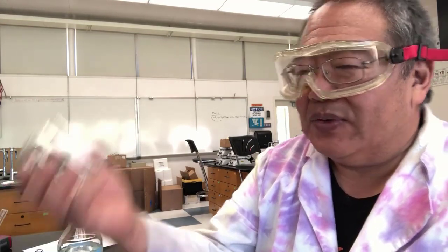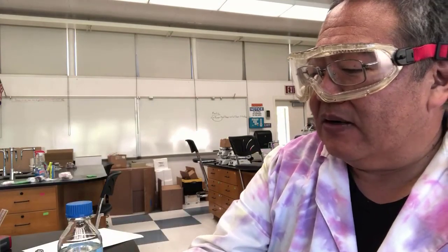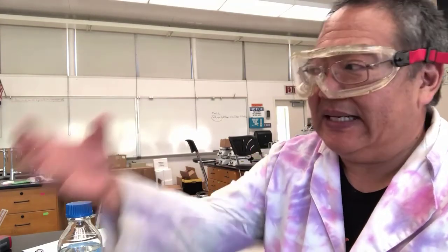Now, what do you do with the extra if you only needed 15 mils? You tell people that you got too much, and then you can give it to them, okay? There are some social distancing rules, so we might have to make it so you take that beaker with too much and stick it next to this bottle and people can pour from that. But typically it's not a big deal. We usually make a lot of extra and then we just dump it, we get rid of it.